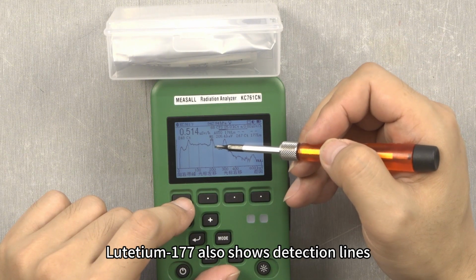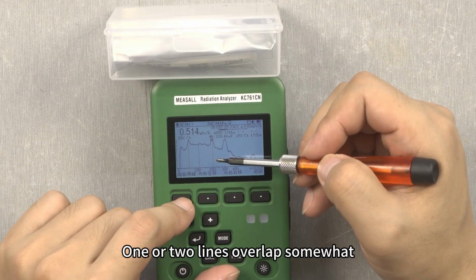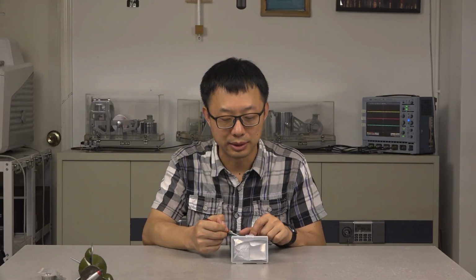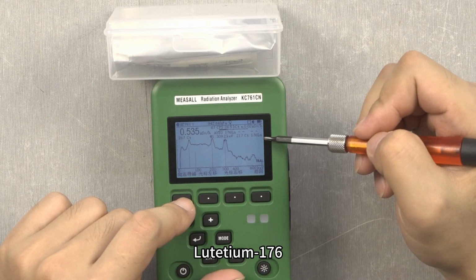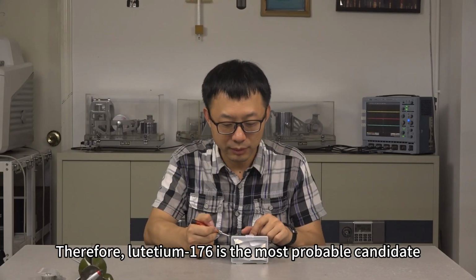Lutetium-177 appears. Lutetium-177 also shows detection lines. One or two lines overlap somewhat. But this primary characteristic peak is not aligned perfectly. Continuing, at this point, three peaks are perfectly aligned. Lutetium-176, therefore, is the most probable candidate.